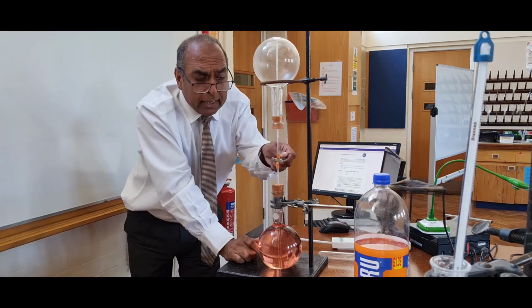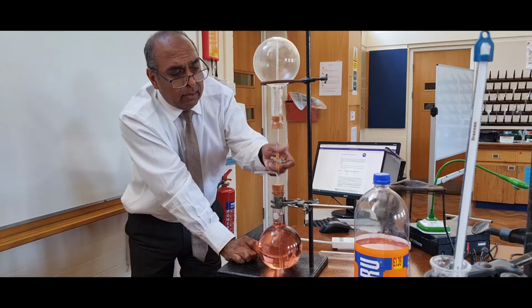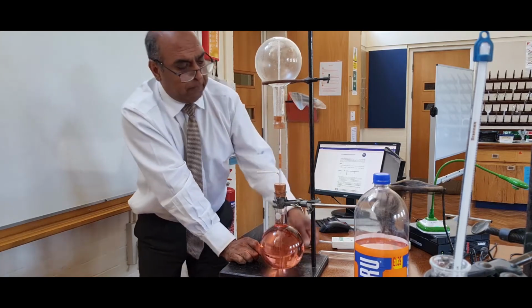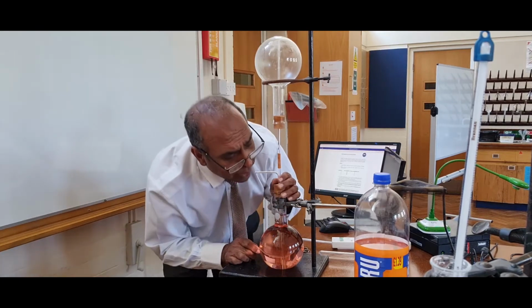I'm going to open the tap that connects the two together, the bottom flask to the top flask, and then I'm going to start the fountain experiment by blowing.